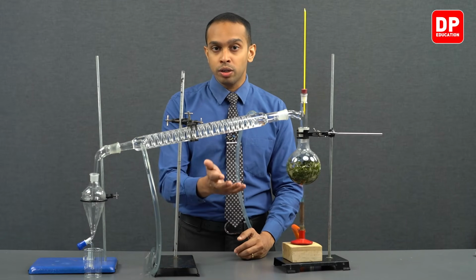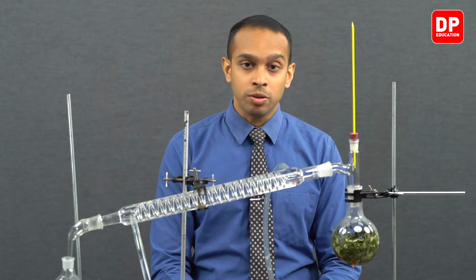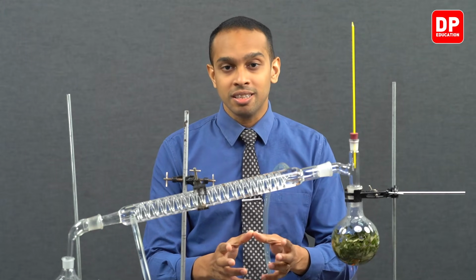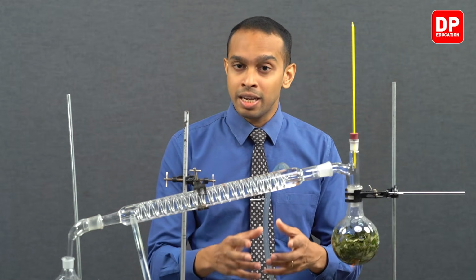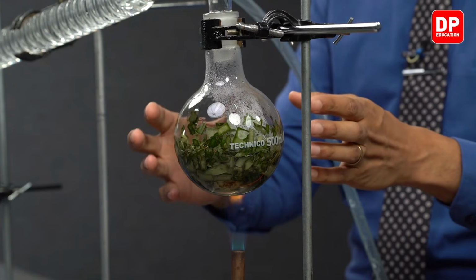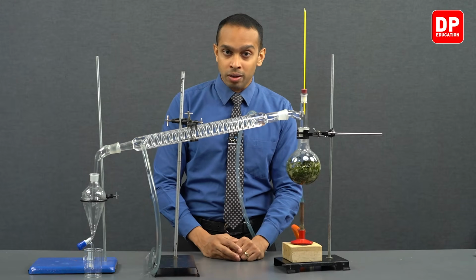As the temperature of the water increases, the cinnamon leaves that we have included in this round bottom flask will have its cells ruptured, and the essential oils that were stored in the cells will be coming out into water, like I explained earlier. So we will continue to provide heat, and at one point you will observe that there will be a vapor produced, or that this particular mixture will start to boil.